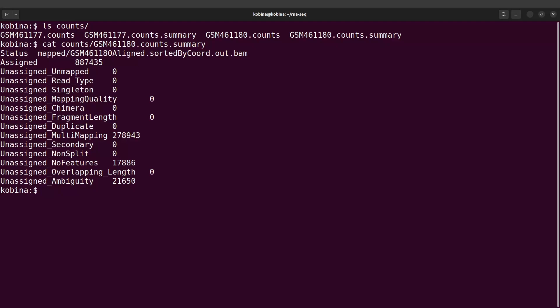Now we have two samples, so we have read counts for two samples. You could also have a situation where you have more than two samples. In that situation, it would be useful to aggregate these reports into a single report or a single file. What we are going to do next is aggregate these two reports using MultiQC. MultiQC allows us to aggregate our reports so that we can view and compare them to one another.